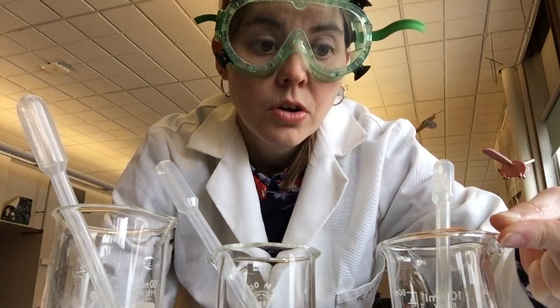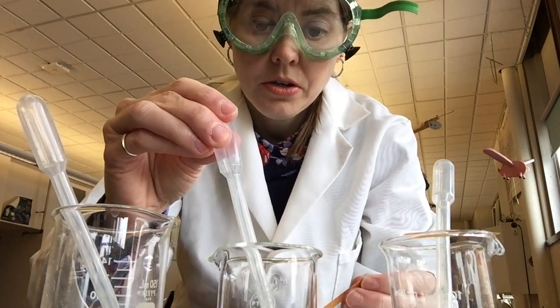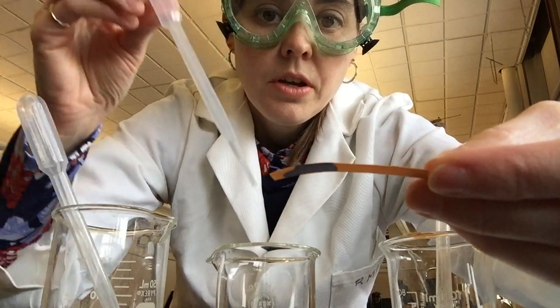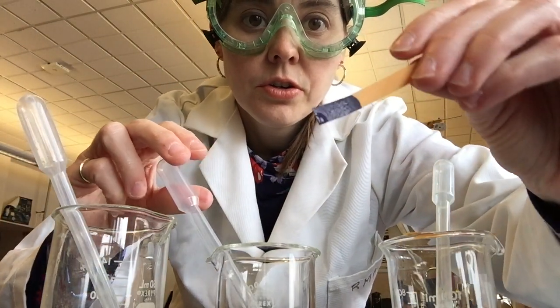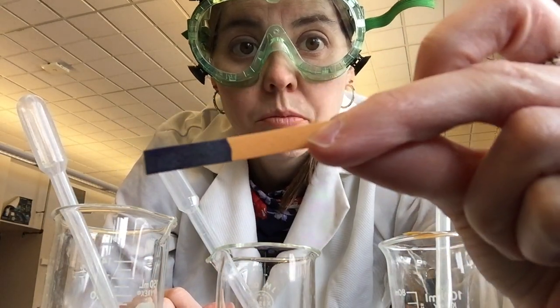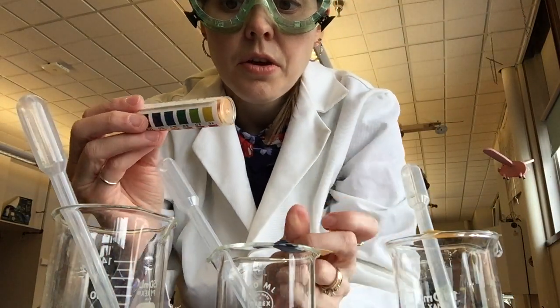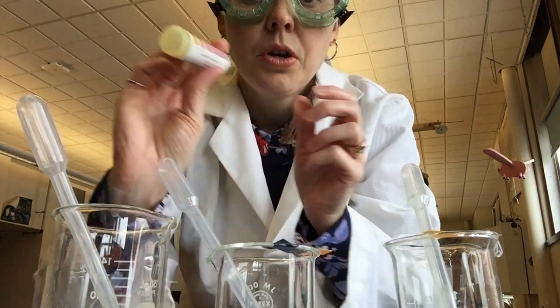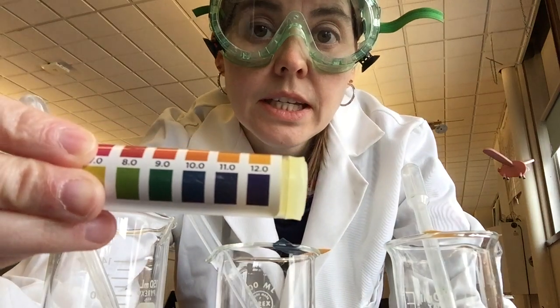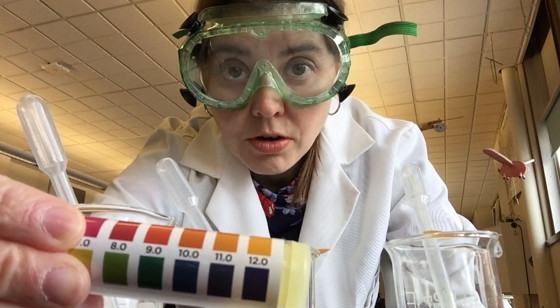The one in the middle — I'll add a couple of drops. This one turned a bright blue. You can see it's a nice bright blue, a very dark color. On my scale, blue corresponds to 10, 11, or 12, so that's a very strong base. Indeed, that one is sodium hydroxide, which is a very strong base.